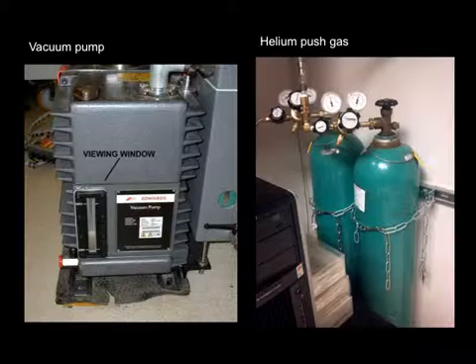So I think it's also the gas that's used for pressurizing the bomb. I could be wrong, but maybe even doing some pneumatics in the system. I'm not really sure exactly, but you want to make sure that you've got this pressure because you do need it for the dissolution.